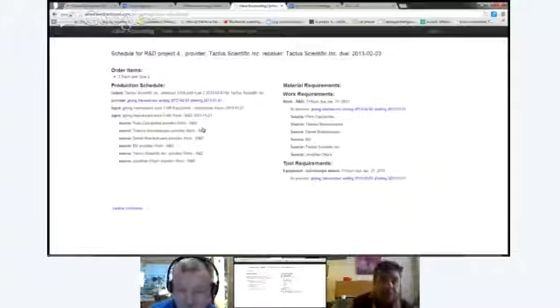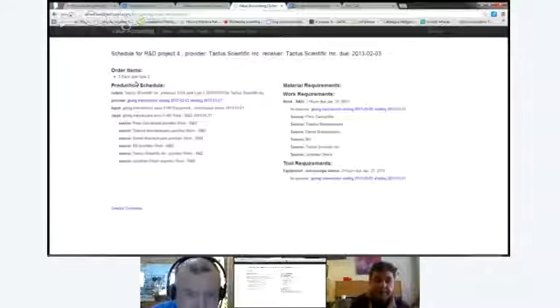Why is this order items? Why do we have to order the join type 2? Maybe because they are like components. The system considers them as components. I'm sorry, what's the question? The first item there, it's order items. That's a bug.